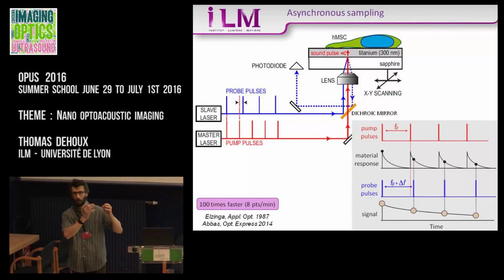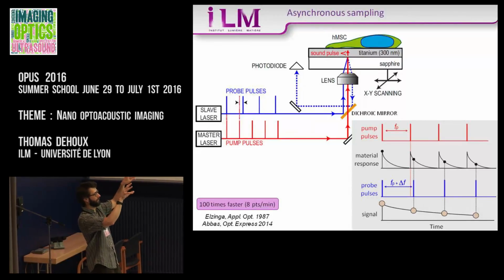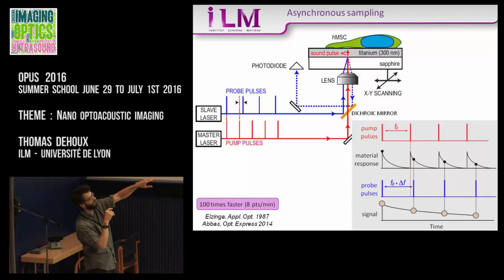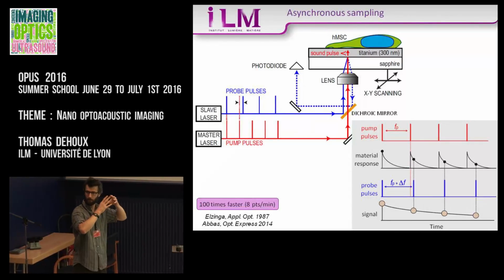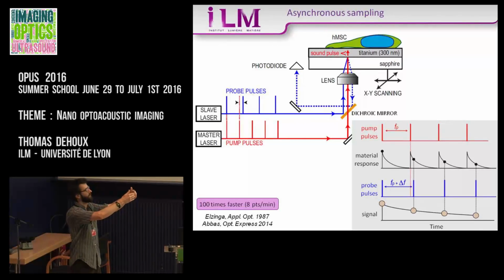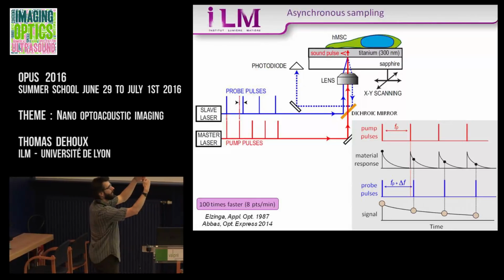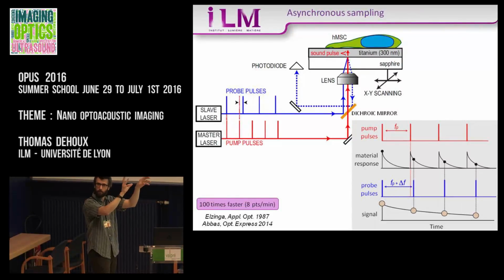So when the first acoustic pulse arrives, you will see the contour of the cell there. You start to see the fibrillar details, and the contrast decreases because the acoustic pulse is moving away from the interface where it is detected. Then the contrast will come back as the second acoustic pulse comes here. It is reversed because the acoustic pulse has changed sign between two reflections.